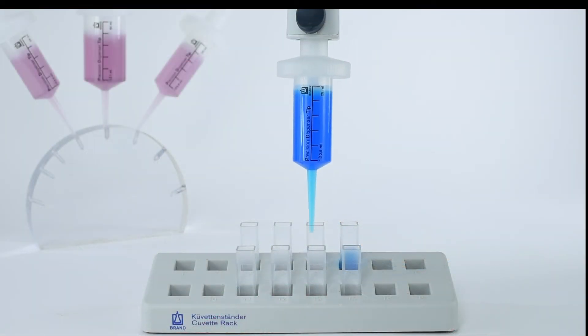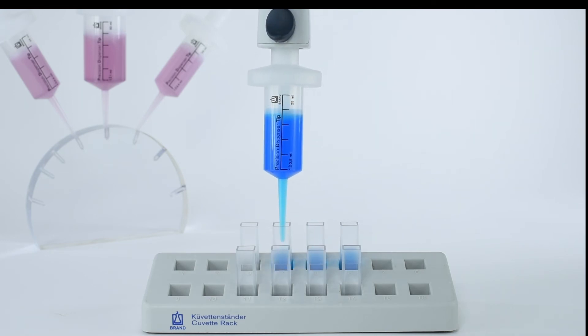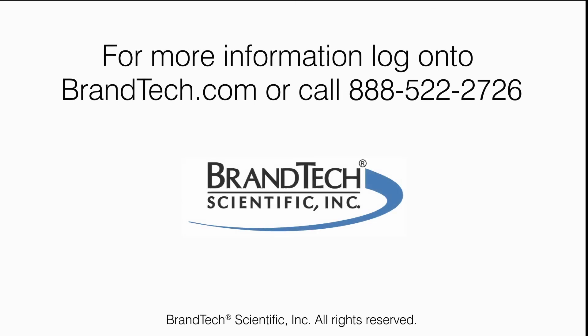Adapters can be reused a number of times but will eventually wear and need to be replaced. If you have additional questions and are located in the U.S. or Canada, contact Brandtech Scientific Customer Service. And for those from other regions, contact your local brand representative.